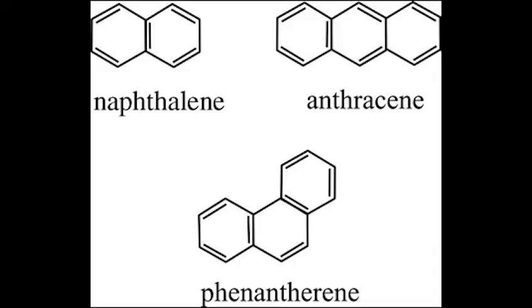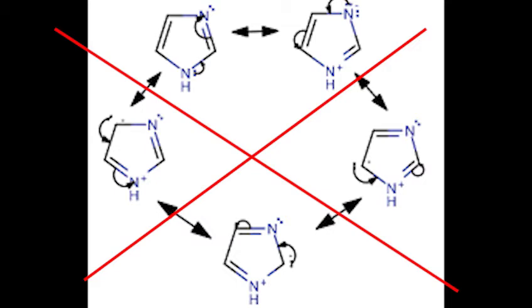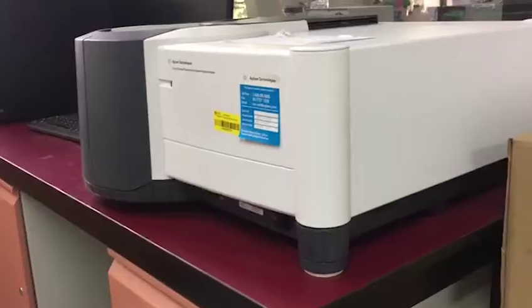Basically, a fluorescent molecule contains a fluorophore, which is able to emit light. Besides, a fluorescent molecule is usually an unsubstituted aromatic hydrocarbon. When the number of benzene rings increases, the quantum efficiency increases. The presence of heavy halogen may stop the conjugation of pi electrons and decrease the quantum efficiency.